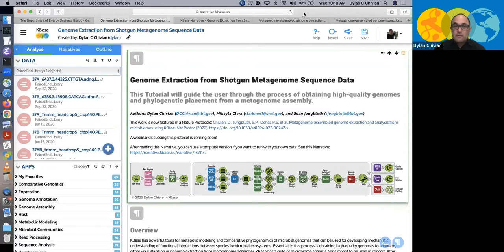So literally just take your sample, if you have enough, and put it in 10 or 96 or whatever number of different tubes or Falcon tubes, and then change the pH on them, change the temperature, maybe get creative, or if there's some relevant condition with some nutrient that they need, change that amount.